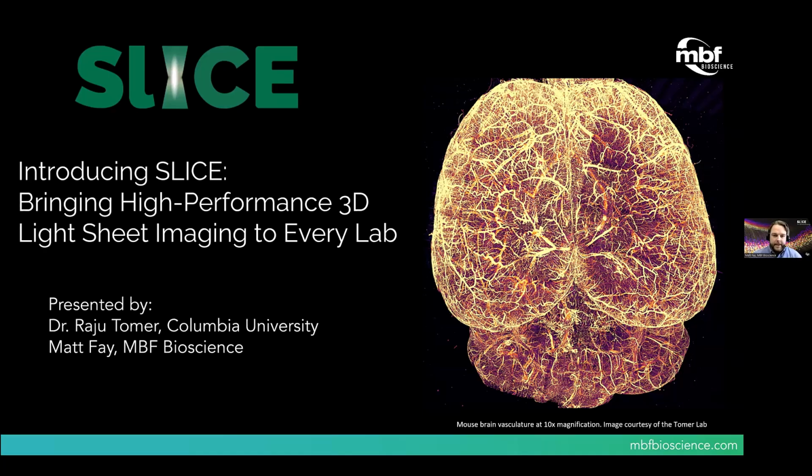He brings leading expertise in light sheet microscopy, having developed several groundbreaking technologies, including the Light Sheet Theta Microscope. During his postdoctoral work at the Carl Deisseroth Lab at Stanford, he contributed to the development of the CLARITY tissue clearing technique and created the COLM, the CLARITY Optimized Light Sheet Microscope. We're honored to have Dr. Tomer join us for this webinar, and I want to thank him for being here today.